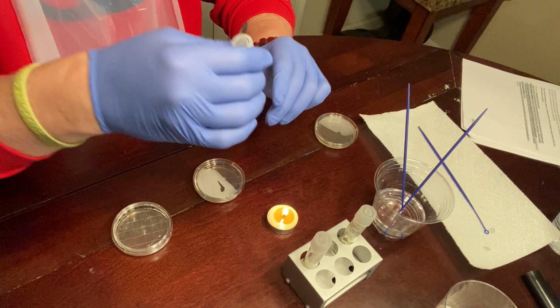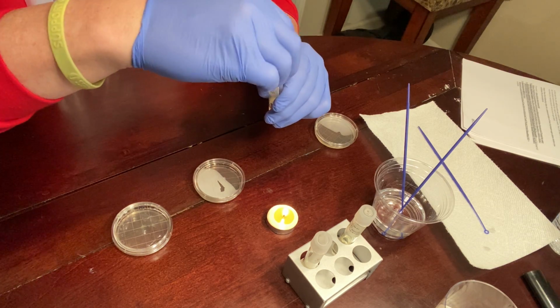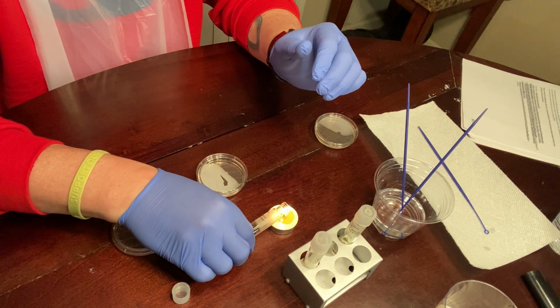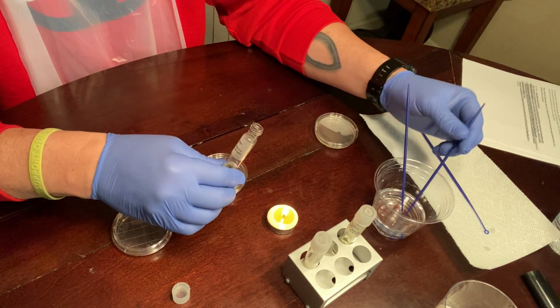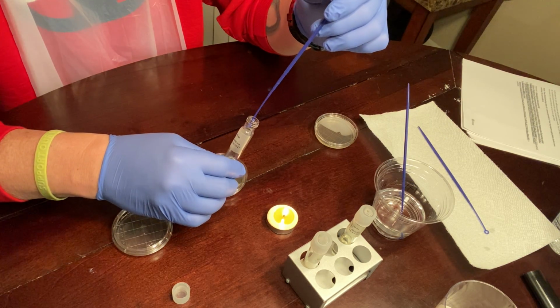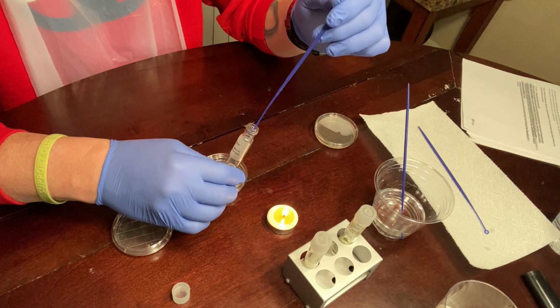So this is the cerevisiae. With the corresponding dish. Careful not to touch the rim.